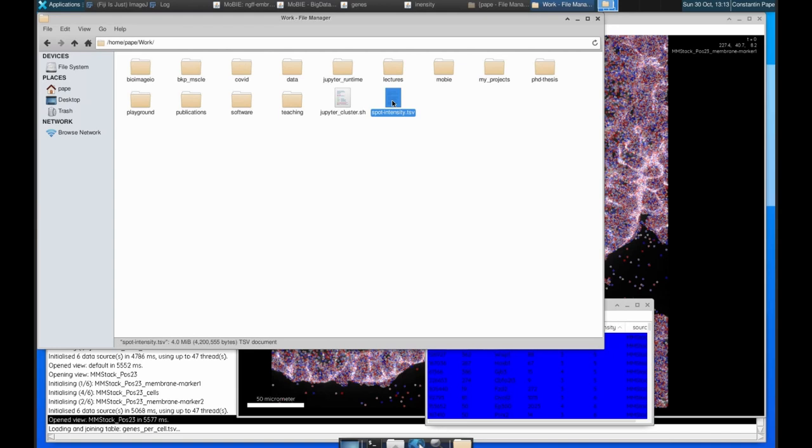Or you can take the tables in Mobi and save them onto your file system and then do whatever analysis you want. So the point is that it's quite flexible in terms of what you want to do with your analysis.